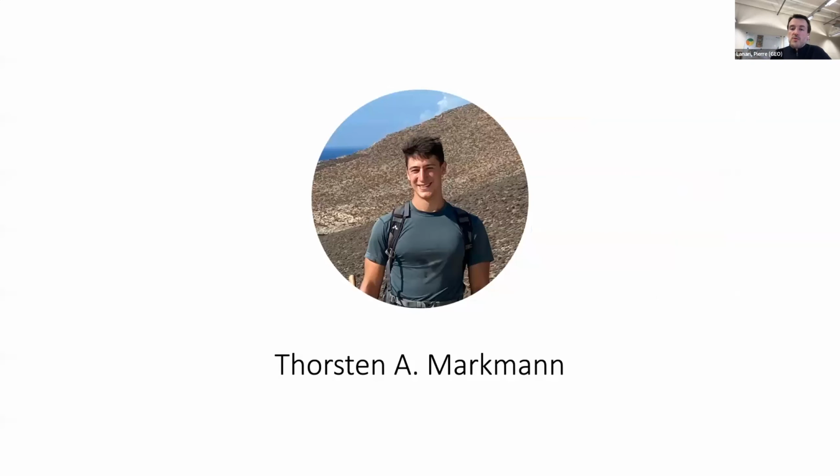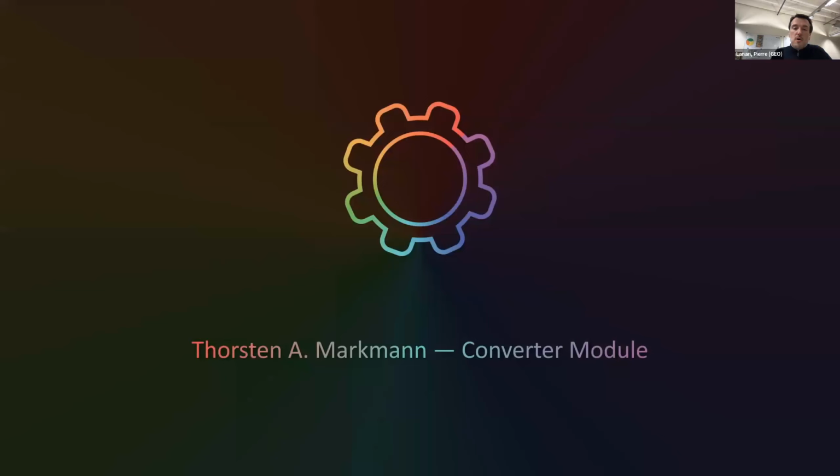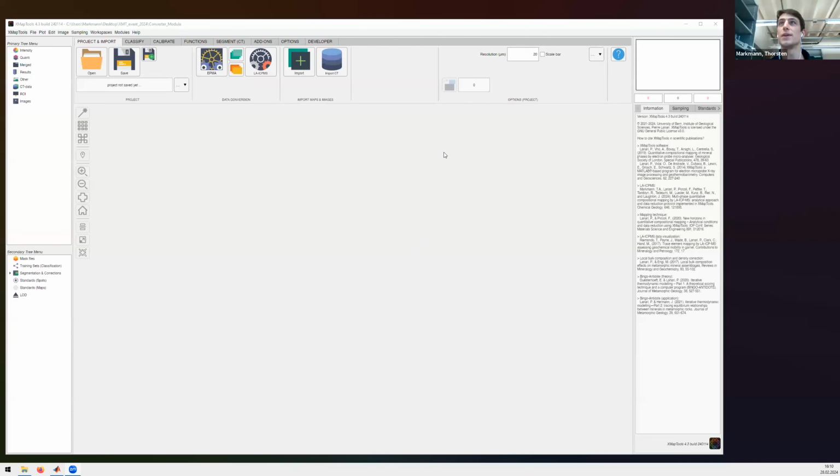So in order to show you the converter module, I would like to introduce you to Thorsten Markmann from the University of Bern. And Thorsten will tell us more about this new converter module. Please, Thorsten, the stage is yours. Thank you very much, Pierre.